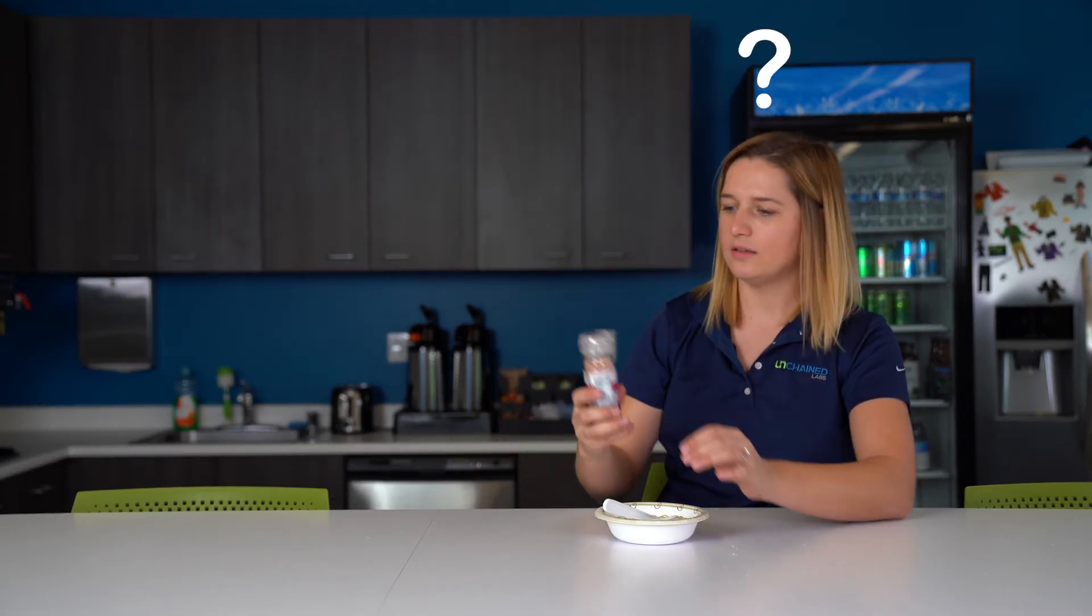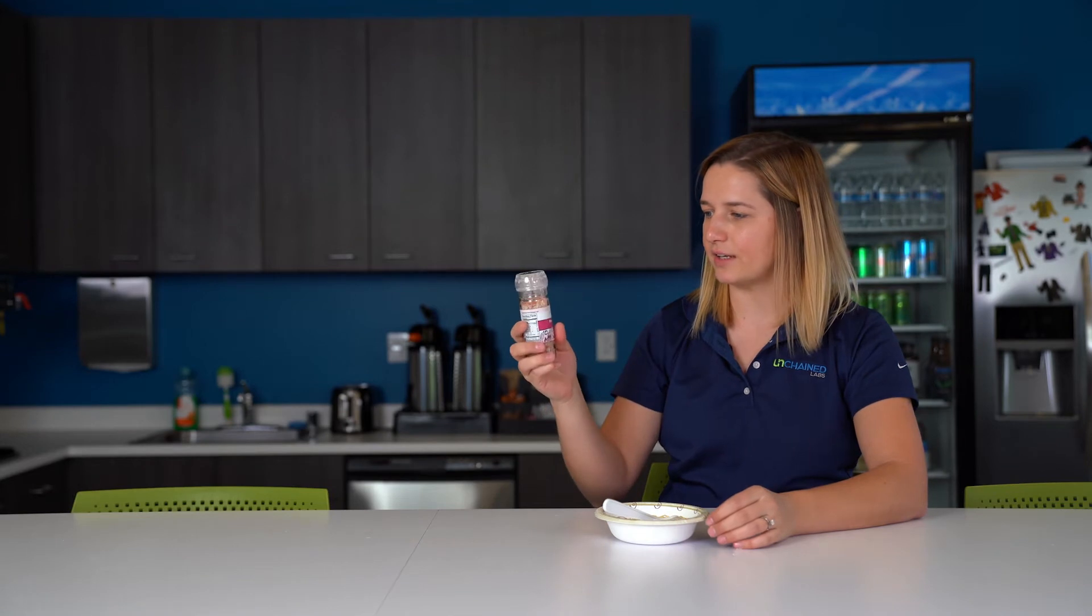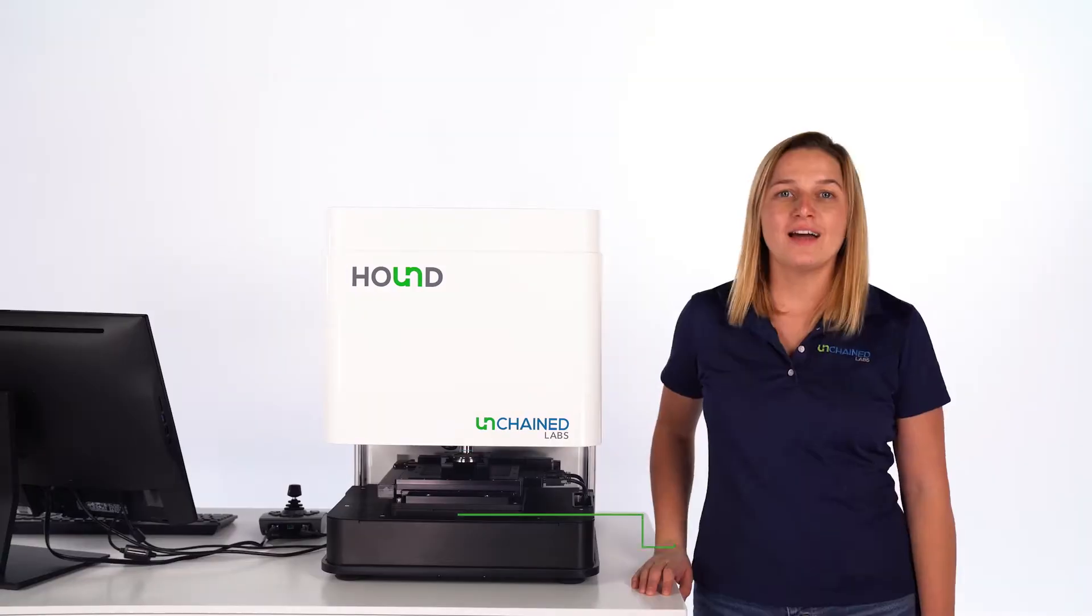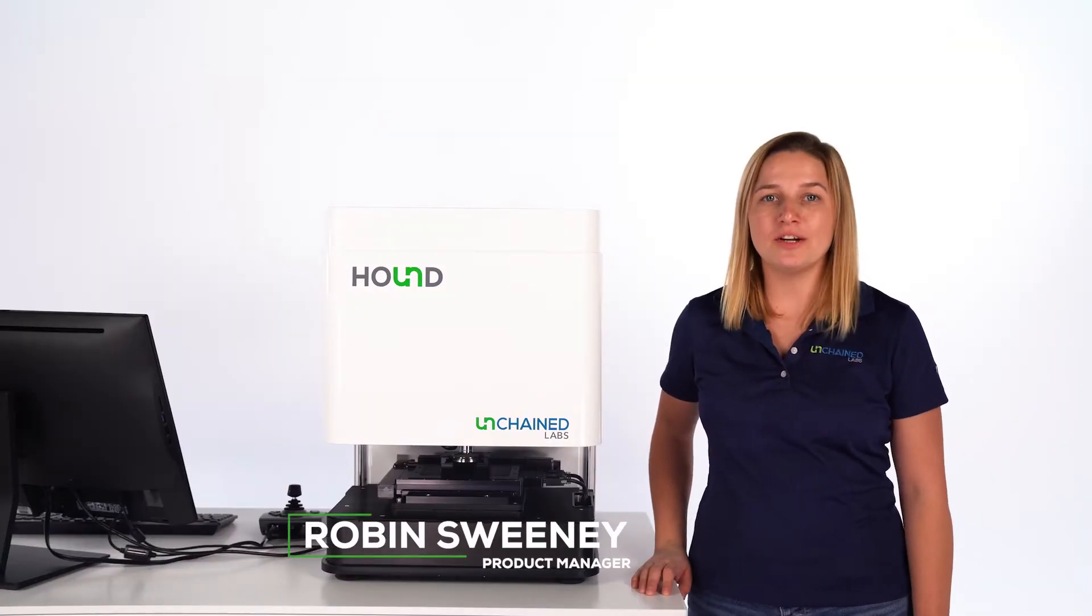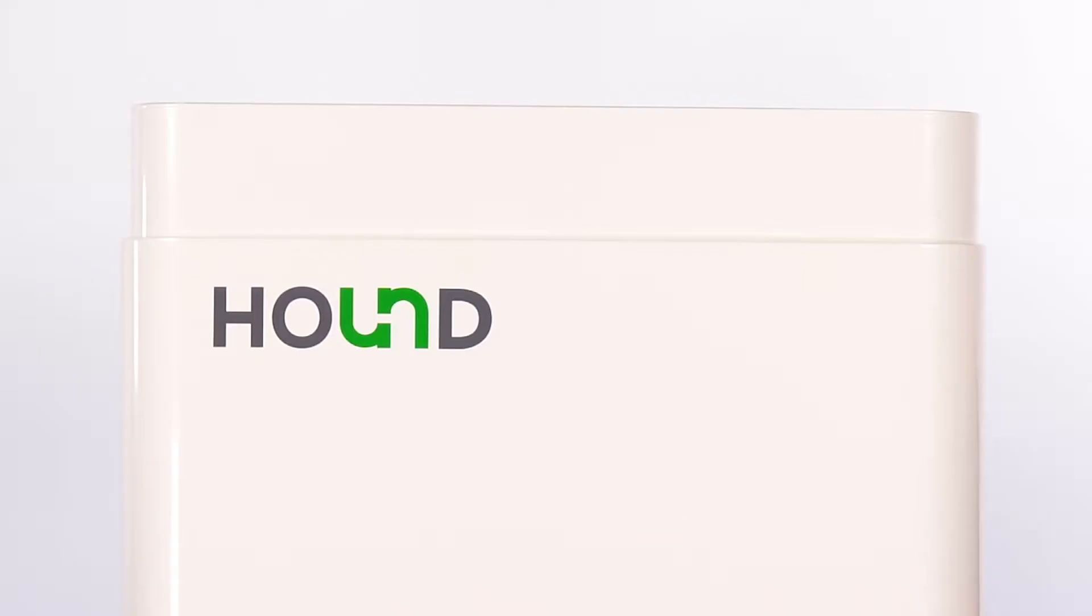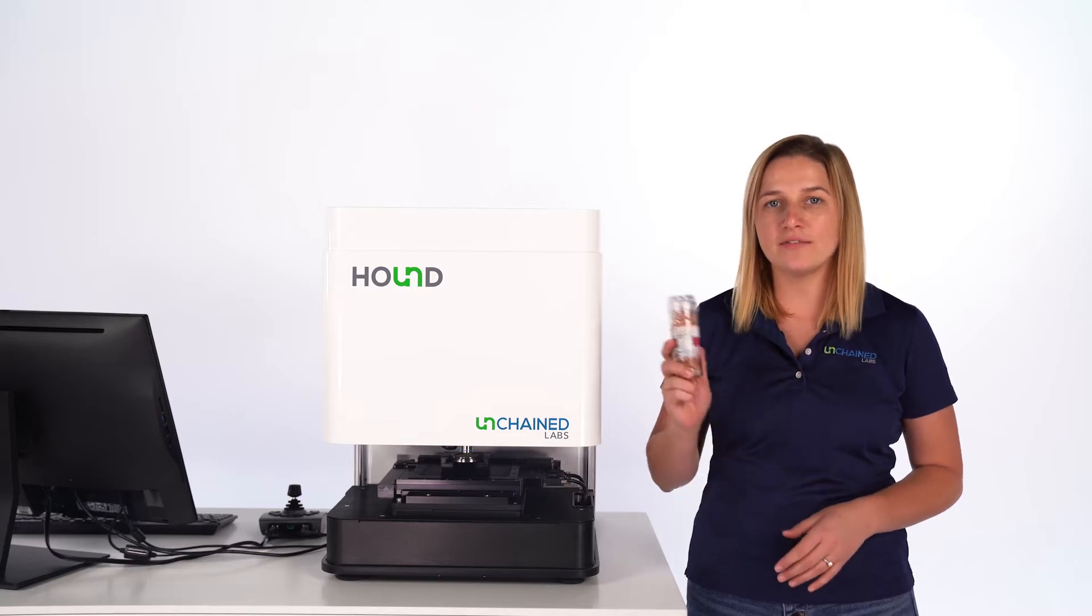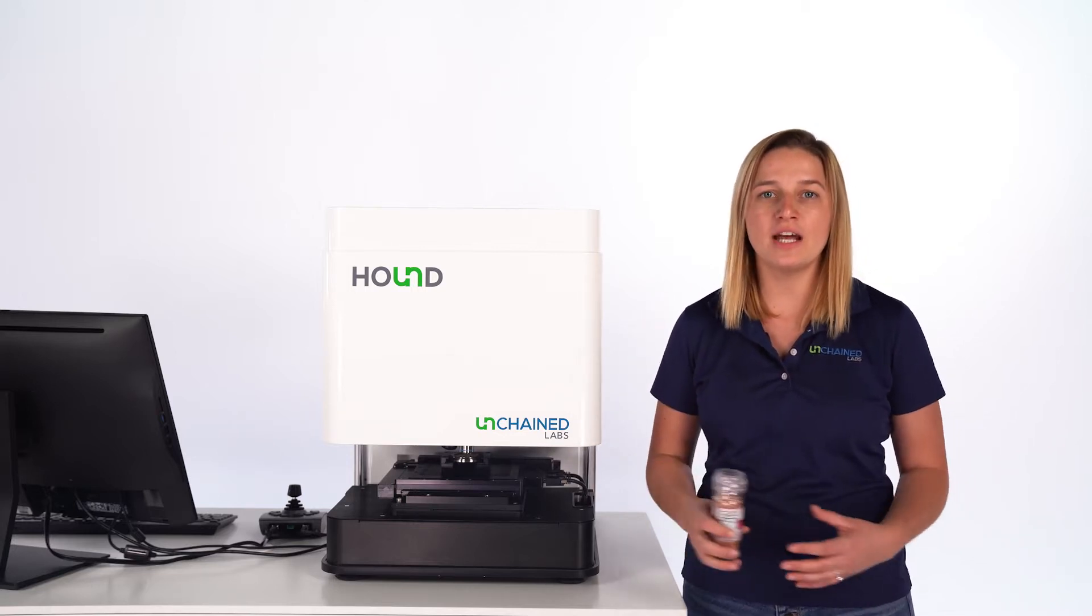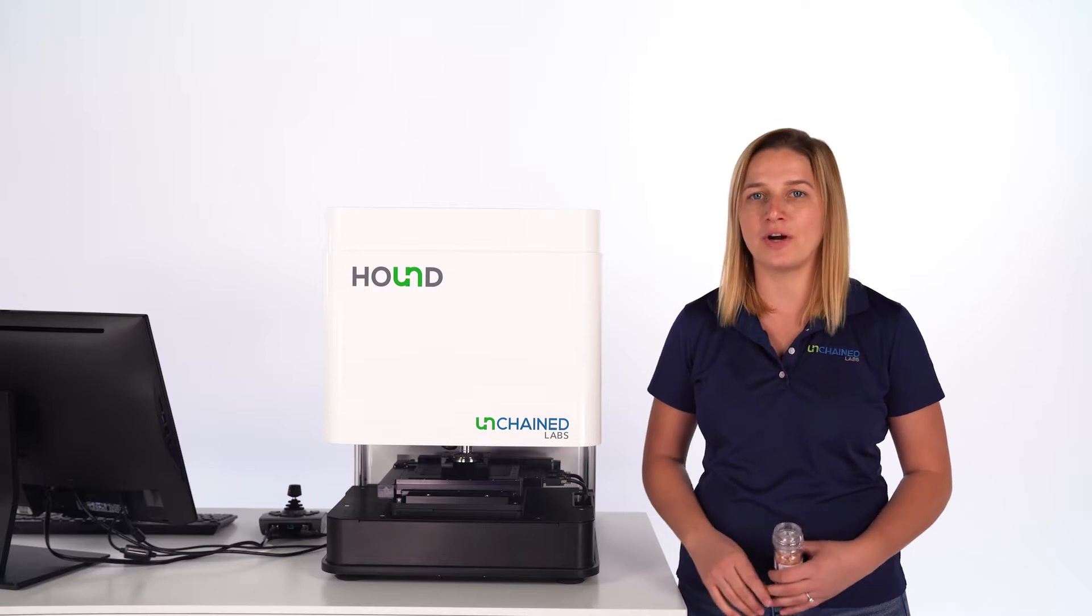Wait a second, what else is coming out of this thing? Let's find out. Hi, I'm Robin, and I'm here to introduce you to the Hound. You'd hope the only thing that comes out of this grinder is salt, but Hound can help us check if there's anything else we're grinding onto our food.